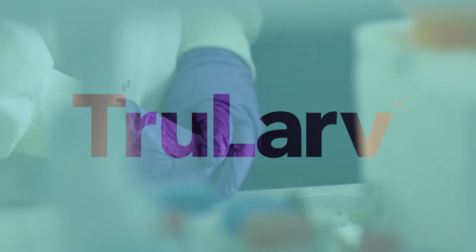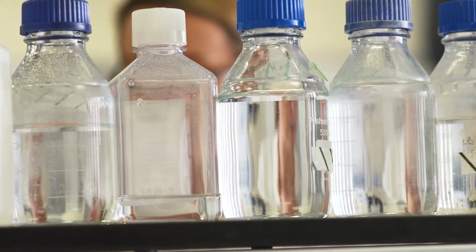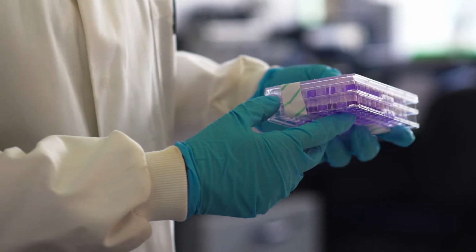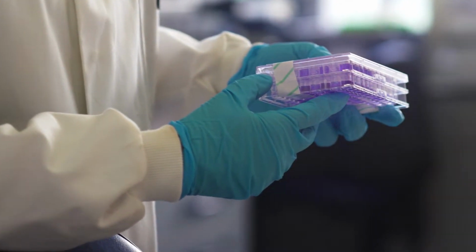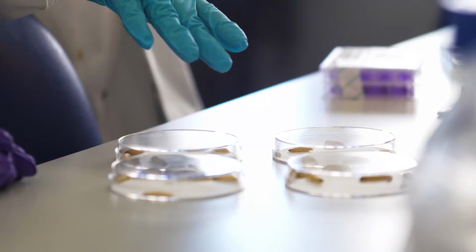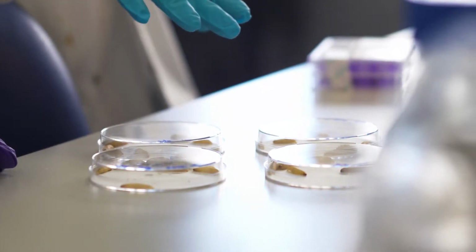As part of my research over the past 10 years or so, I look at bacteria that cause infections in humans and try to understand how they cause disease and how we can try and prevent that disease or cure that disease. That type of work typically uses animals at some point in the study. There's huge pressure to reduce the number of animals that are used. I was interested in looking at alternatives to working with mammals.